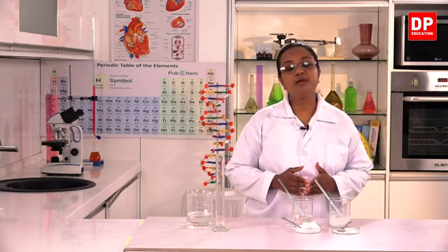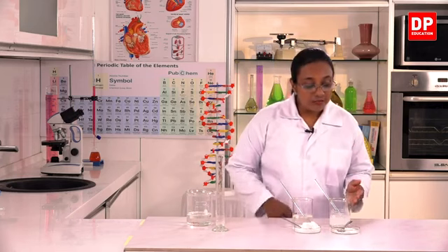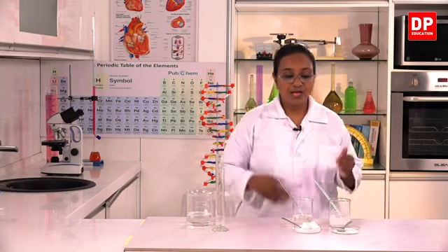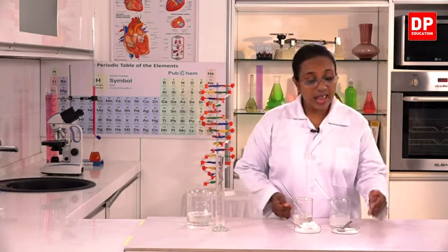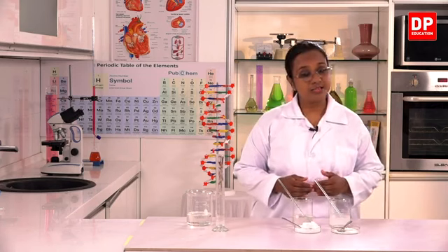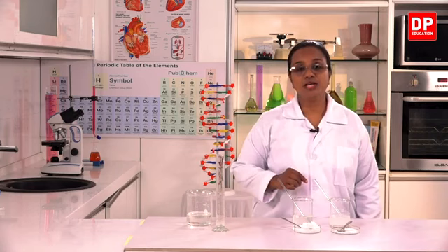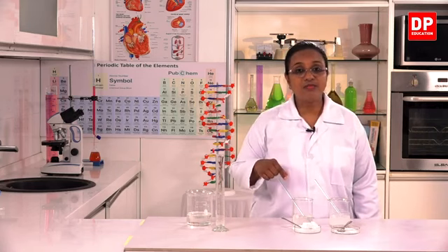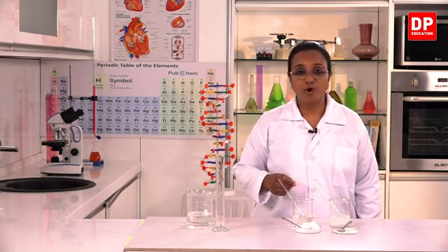More sodium chloride will dissolve in water. Very less amount of calcium hydroxide dissolves in water. Now here we took 100 grams of sodium chloride and only 10 grams of calcium hydroxide. Even if I put some more sodium chloride and dissolve it, you know that it will dissolve in water.